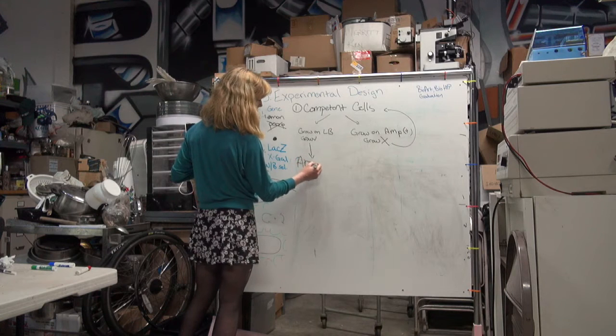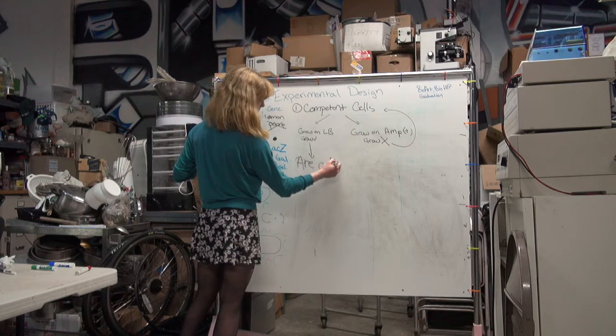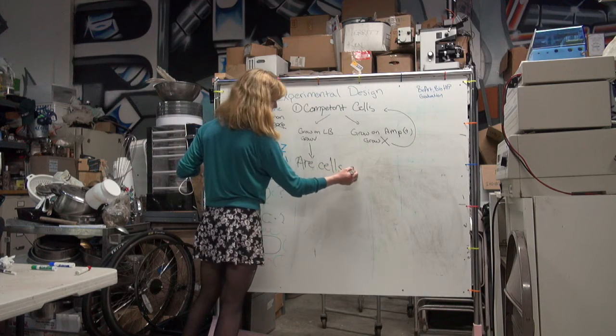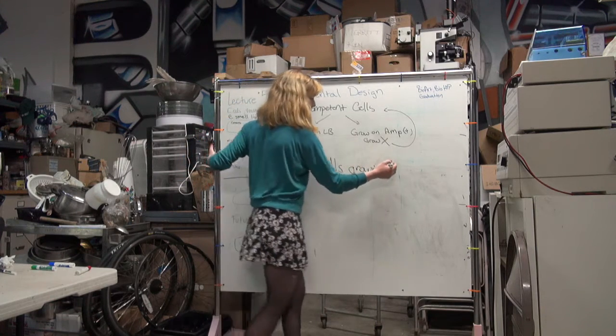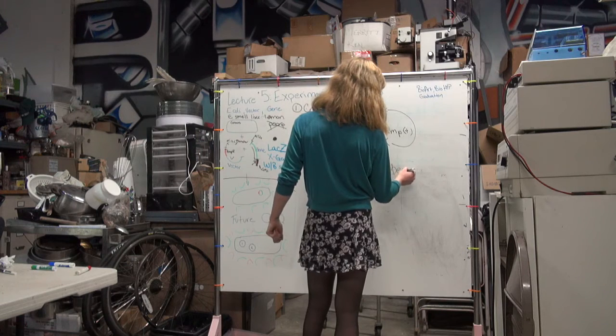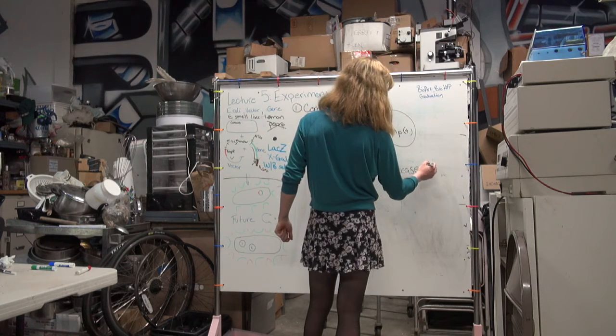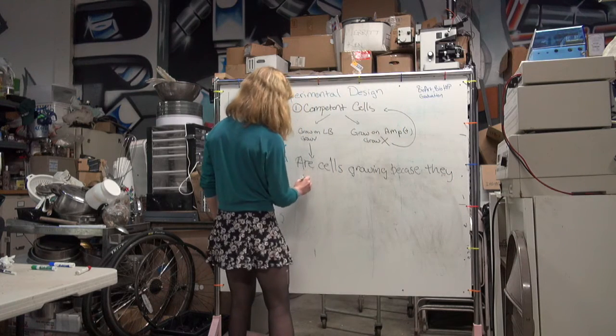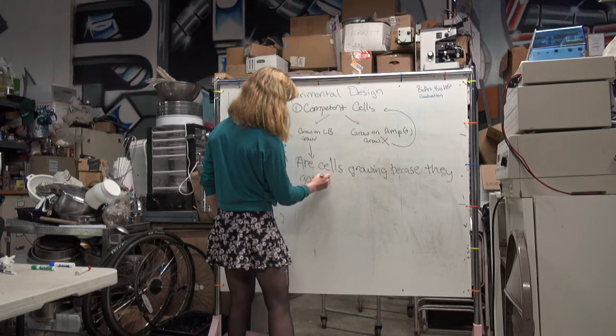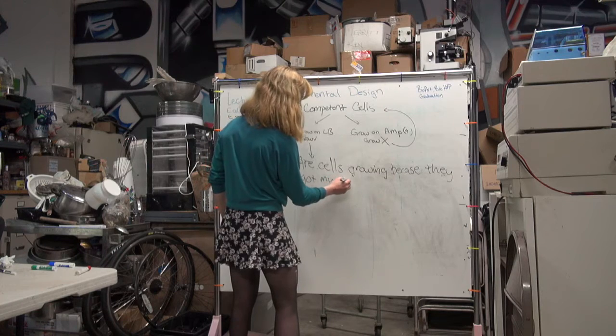The plasmid contains resistance genes. Are cells growing because they got my plasmid?